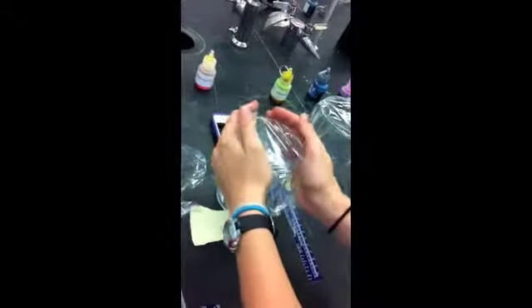After placing all the known dyes, you place the last dot, being your unknown. After you've done that, you place your TLC sheet in your solution, this one being the 1:1:1 ratio, and let it sit for 10 to 15 minutes.